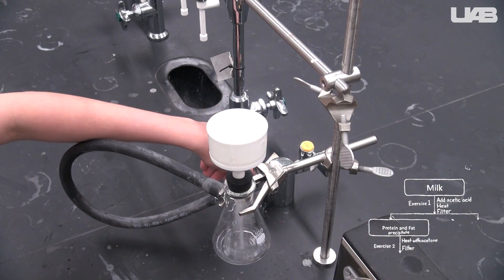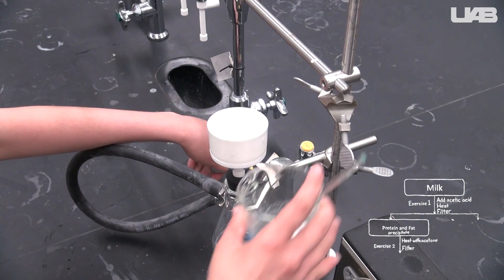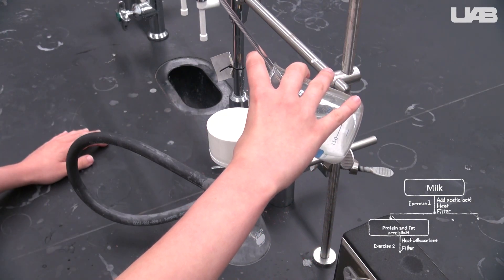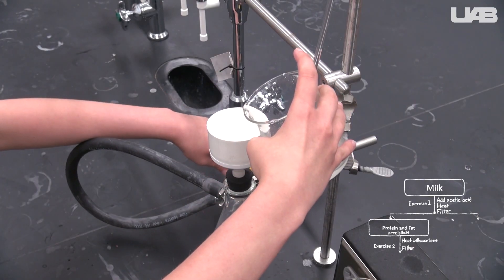Turn the vacuum on. Slowly decant as much of the liquid off before the solid starts going in because the filtration will slow down once the solid is there.